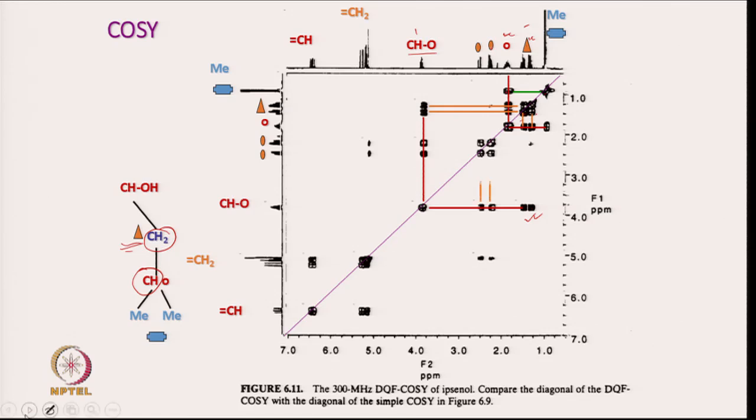So, this is basically coupled to this CH2 group. Now the chemical shifts of these protons are also assigned.